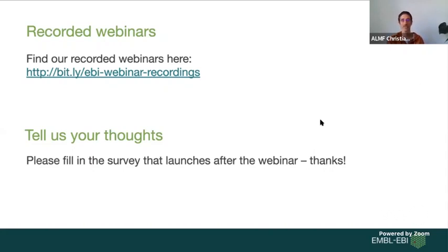So you can just input your image and see. And there it's important indeed to check, to find something that works for all your images. So these automated thresholding algorithms, they all have their little regimes where they work more or less well, but they definitely exist and exactly for your use case, and it's fair enough to use them. So yes.